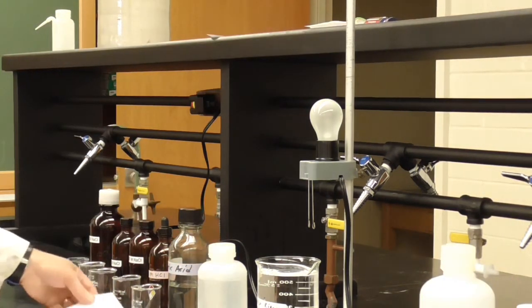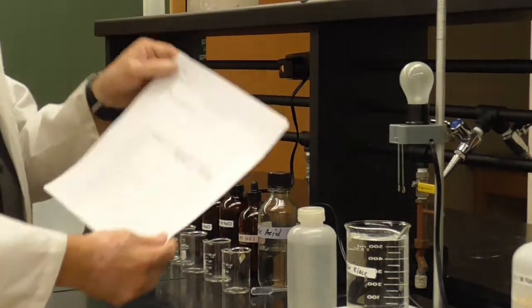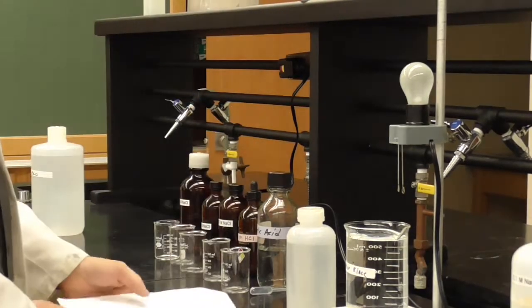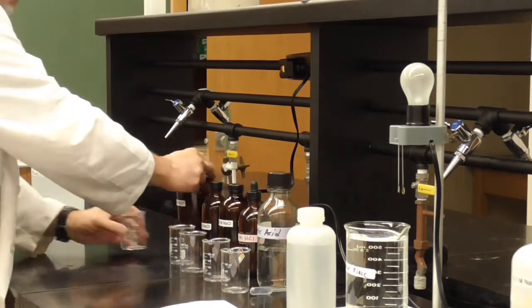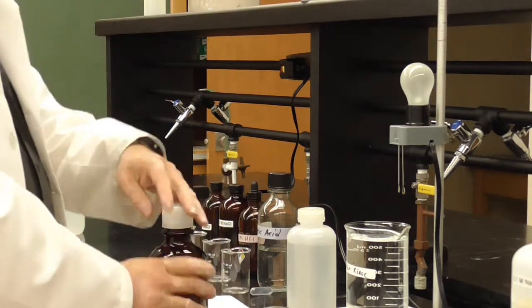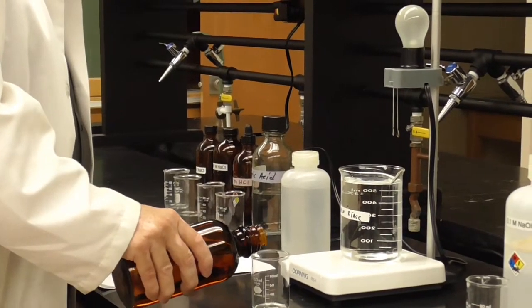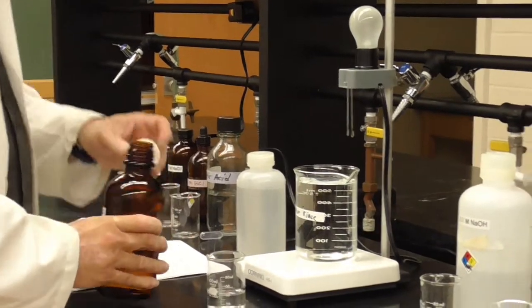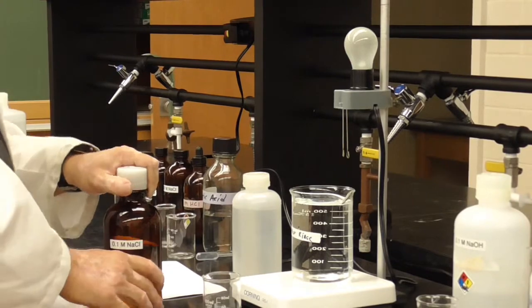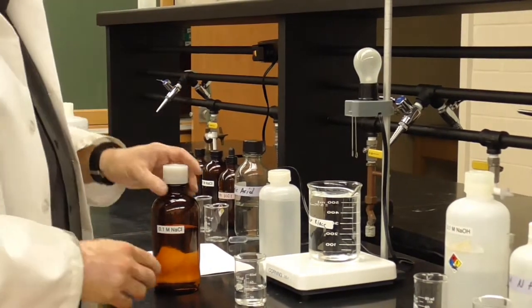All right? And we'll just go right down the list that's right on your data sheet there in order, trying these different solutions. So the first one, 0.1 molar sodium chloride. Molar means moles per liter. That's a measure of concentration. That's simply referring to how much sodium chloride is actually dissolved in this liquid. So this is again at 0.1, that's the level. I could go higher, I could go lower, if I put more salt in. Sodium chloride is just table salt, right?